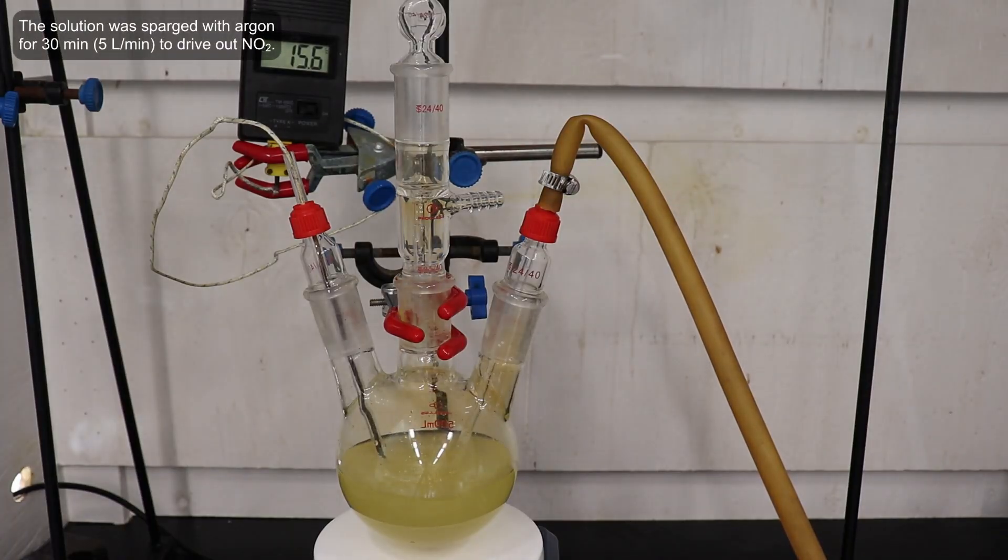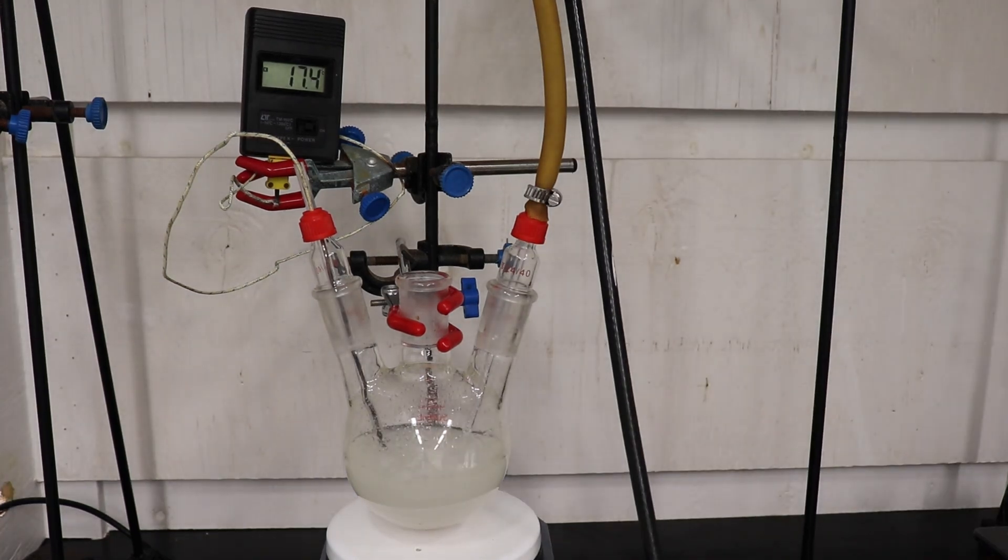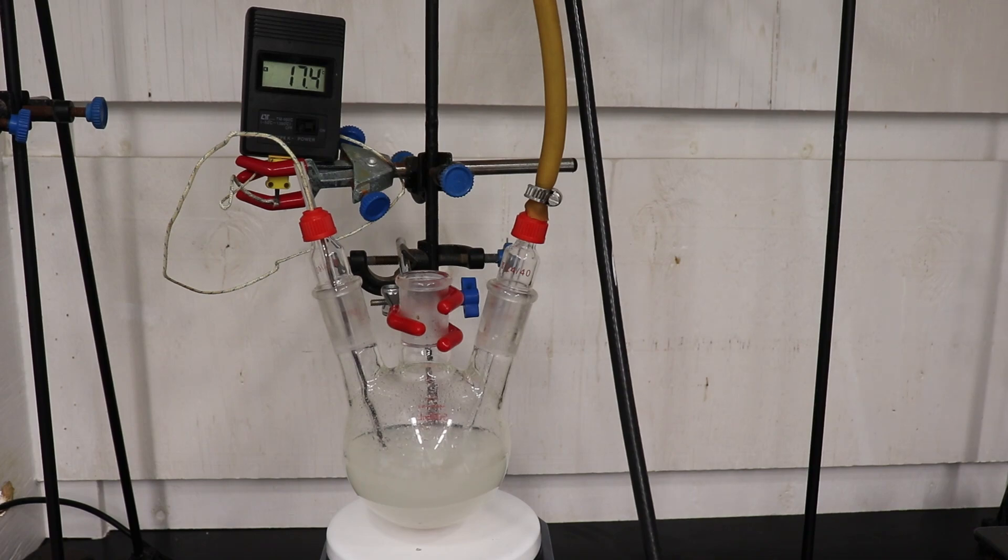To remove the remaining nitrogen dioxide, I sparged the solution with argon for 30 minutes, with a flow rate of 5 liters per minute. This successfully drove out all of the dissolved nitrogen dioxide, leaving me with a colorless solution.